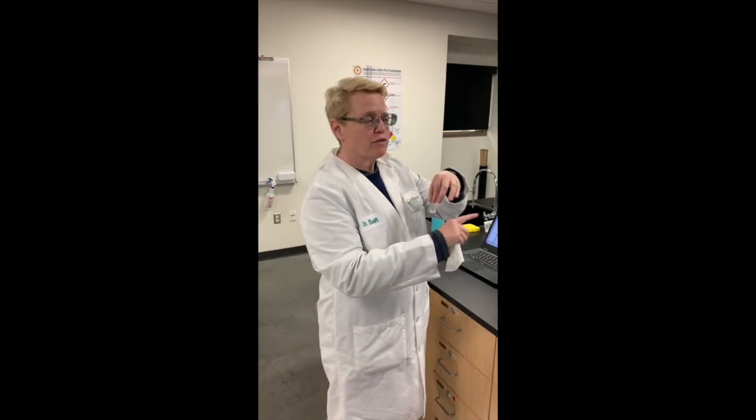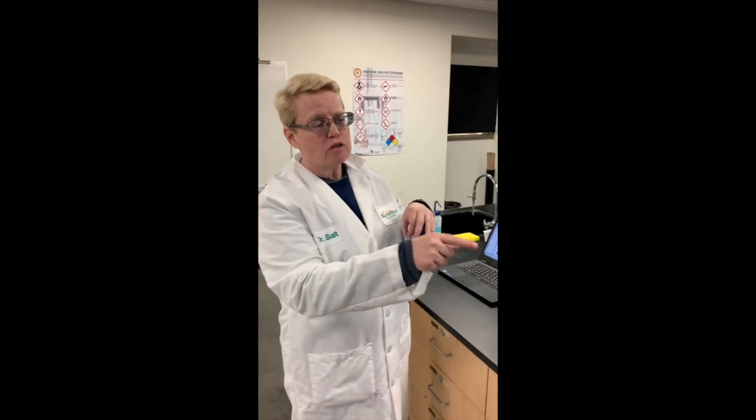So in experiment number 12, we're going to use spectroscopy to actually decide what's in a particular solution. What happens in spectroscopy is basically light passes through a solution, and the more substance that's in there, the more light will absorb. But not only that, when you have different colors, remember that white light's made up of the entire rainbow, but when you see a color, you're seeing the colors of the substance that's actually being reflected, not absorbed. So we're going to actually use a spectrometer to help figure out what wavelengths the particular materials are absorbing, and then we can actually decide what's in them and also decide which one's contaminated.